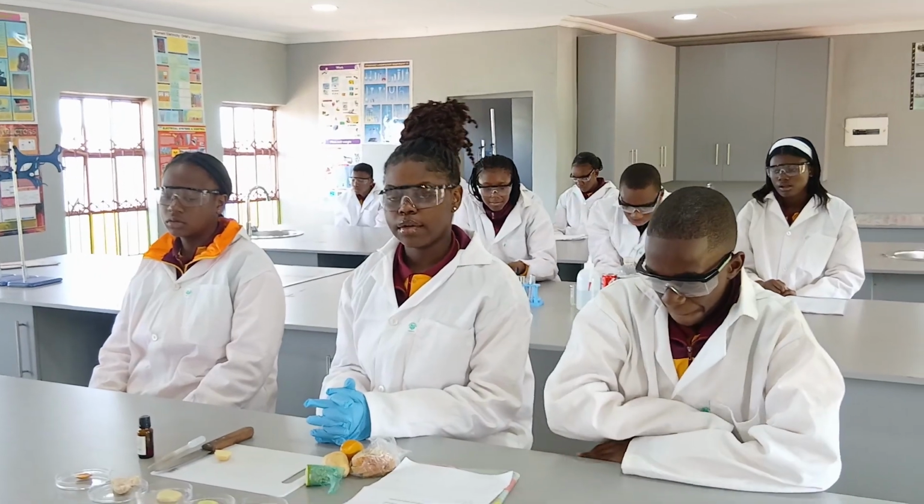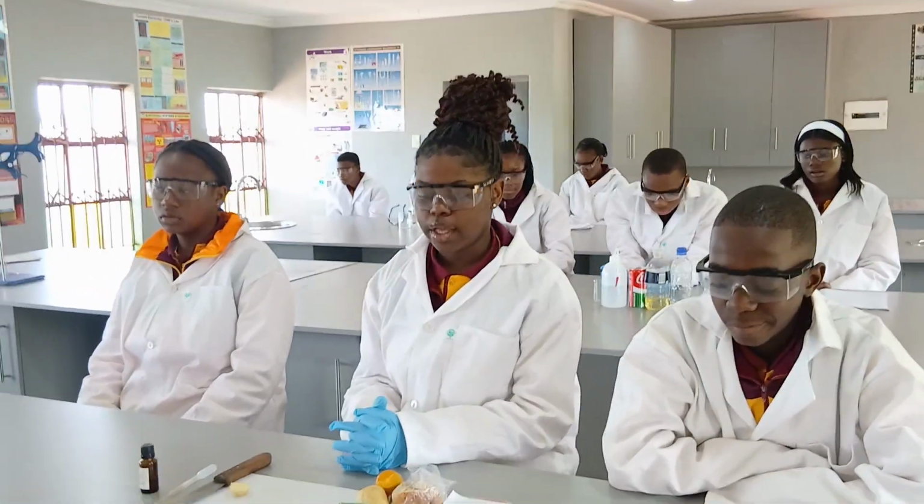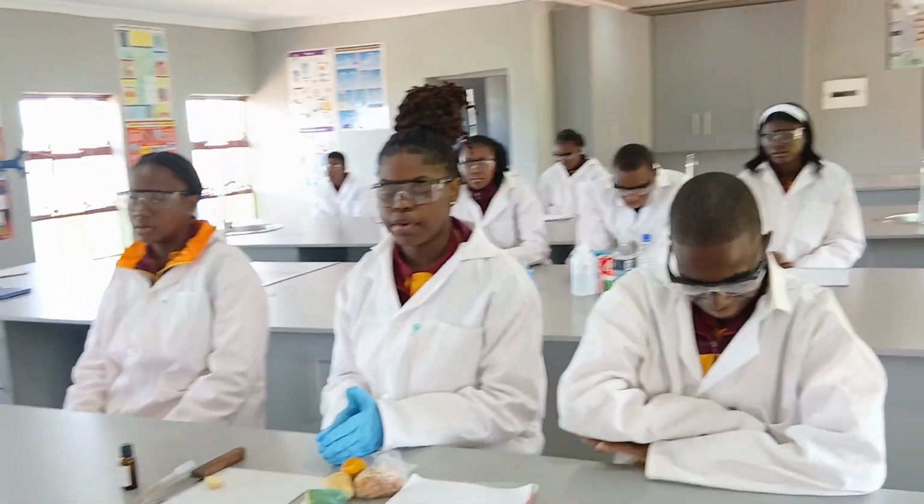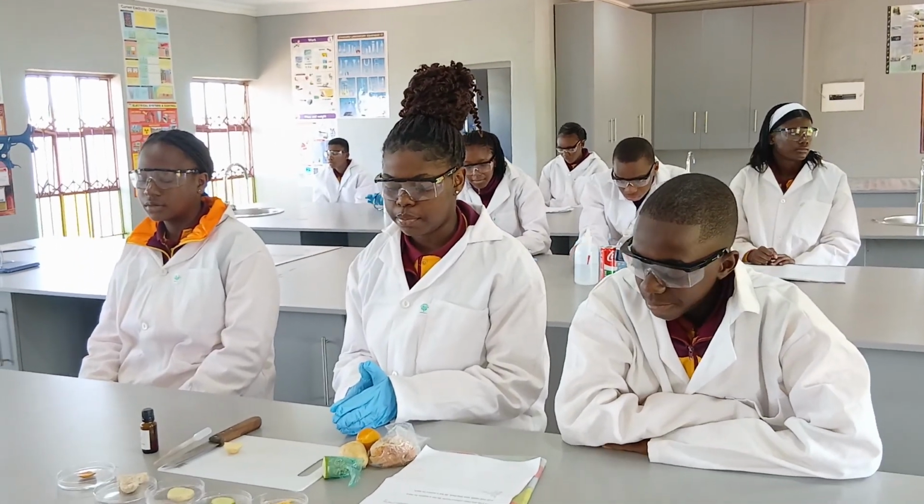Good day, everyone. My name is Shihlobo Matabe, and I'm with my group members here, Cloud Shivamu and Bukonamba. Today we are going to test for the presence of starch in different food samples.